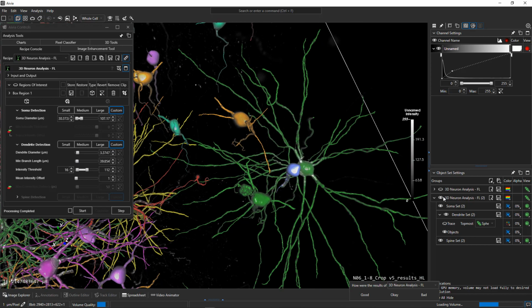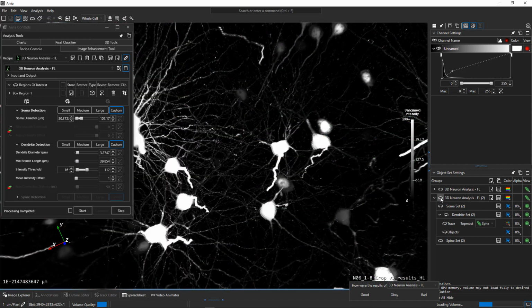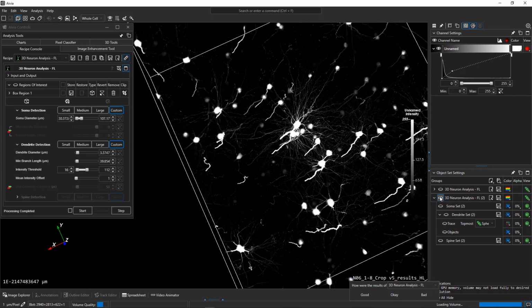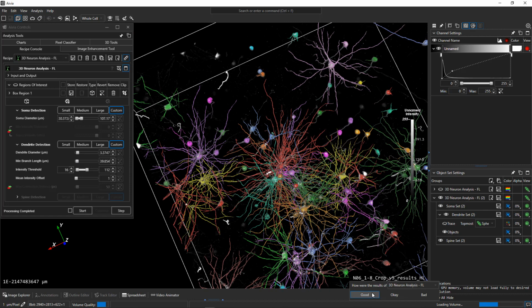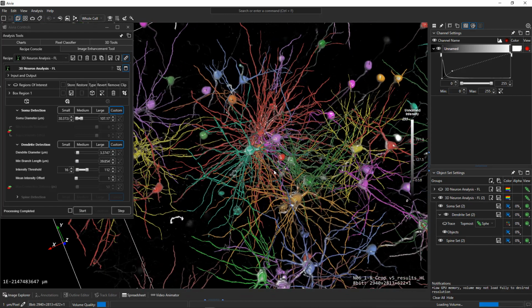Okay. It's pretty good. Yeah. So that would be considered good. Maybe not perfect, but it's certainly good, and for this demonstration, it will be sufficient.